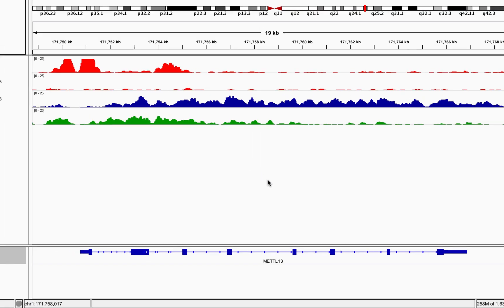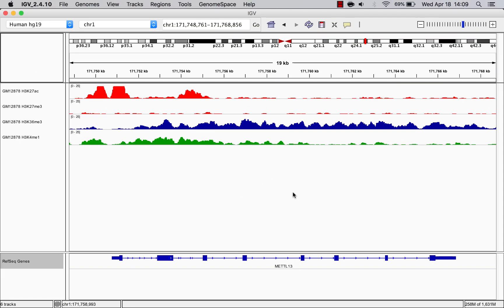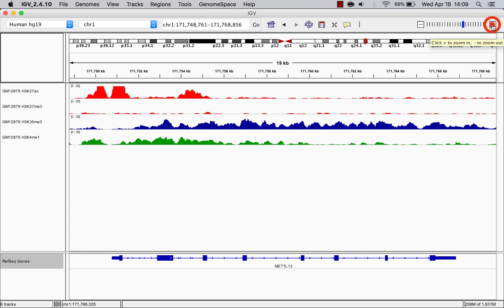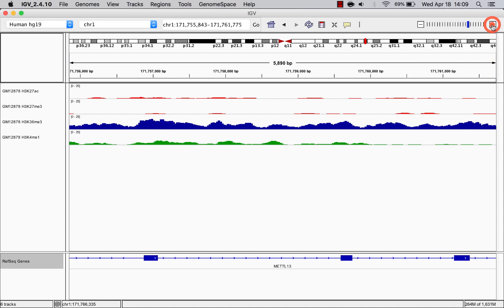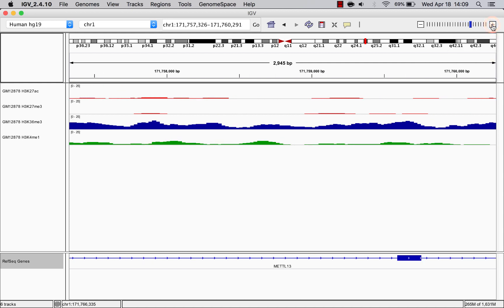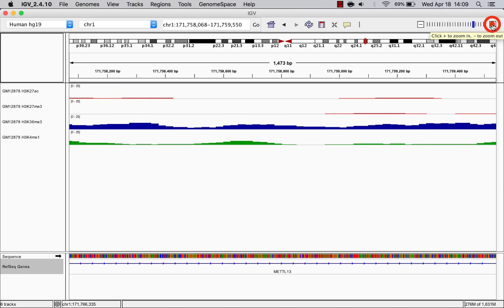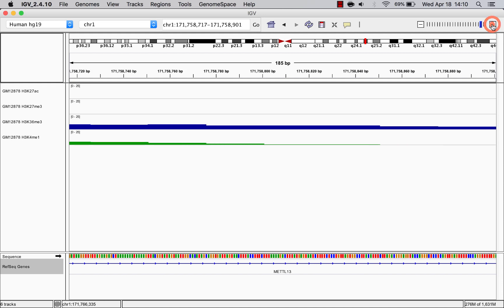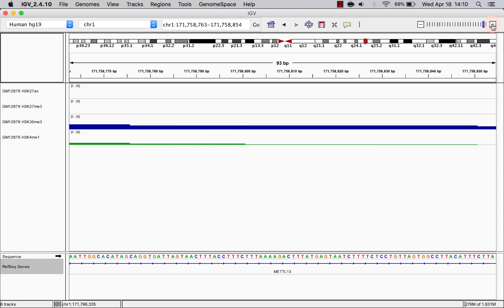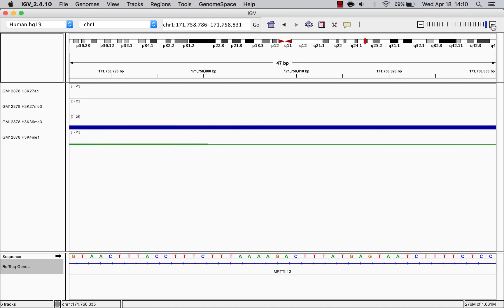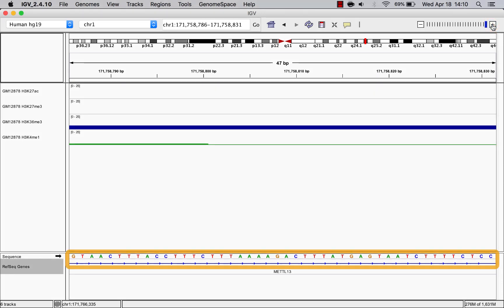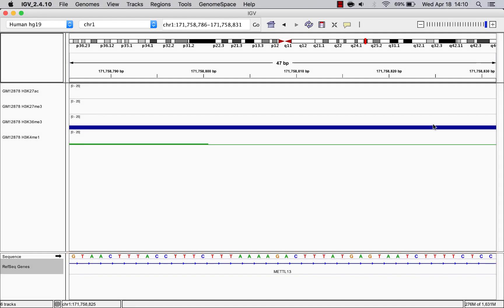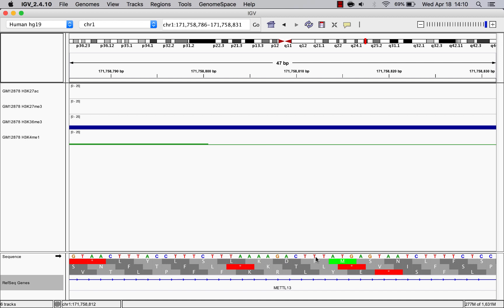If you continue zooming in, you'll eventually reach base pair resolution, where you can see the individual nucleotides. When you're here, the sequence track will show the reference nucleotides. Clicking anywhere on the reference nucleotides will either hide or show the 3-frame amino acid translation.